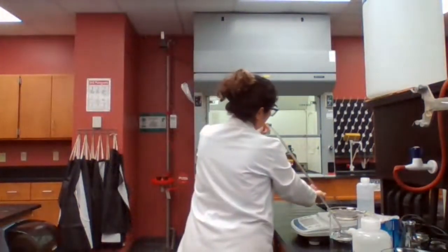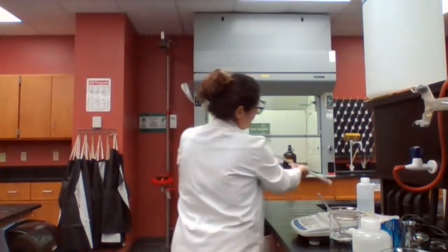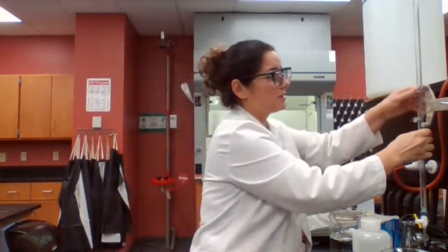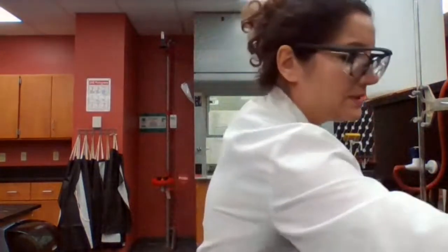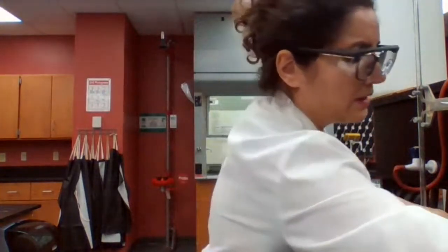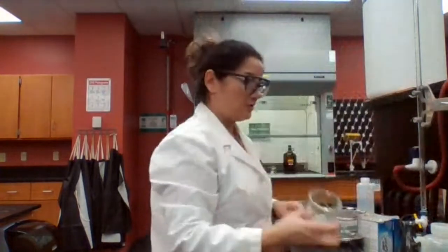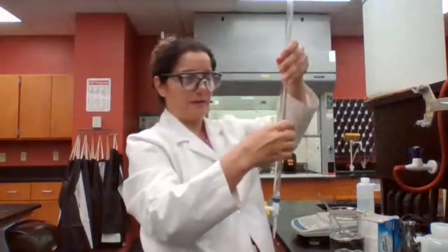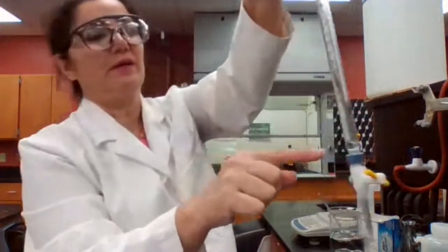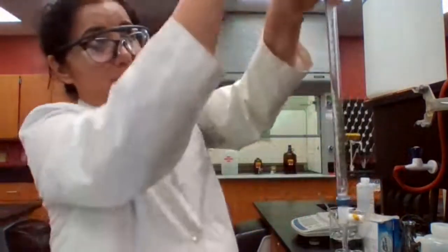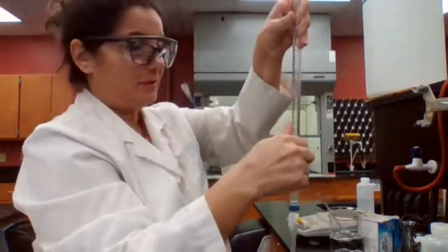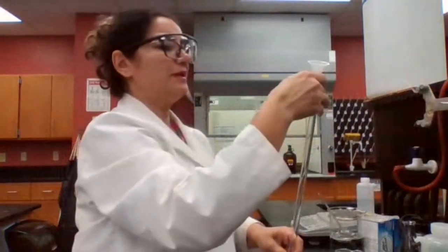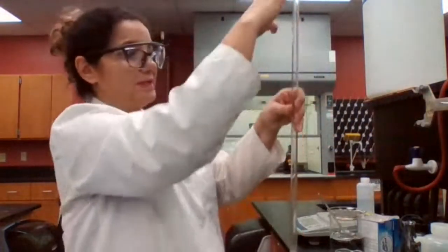Next we want to rinse it. The burette is clean now, but we want to rinse it with sodium hydroxide. Why do we need to rinse it with sodium hydroxide? Because after you wash with deionized water, there might be some drops of the deionized water. You could still see that here, some drops of deionized water in the burette, and that could dilute the solution that we are using.